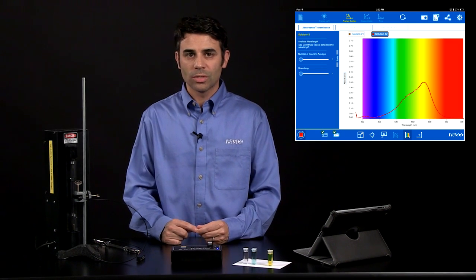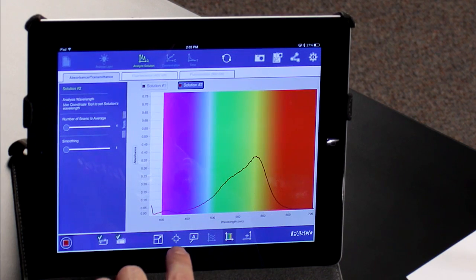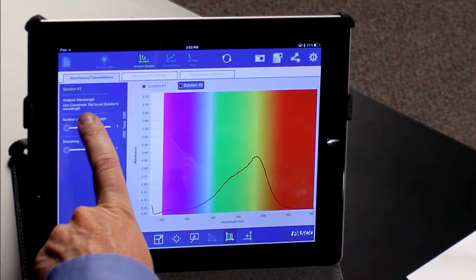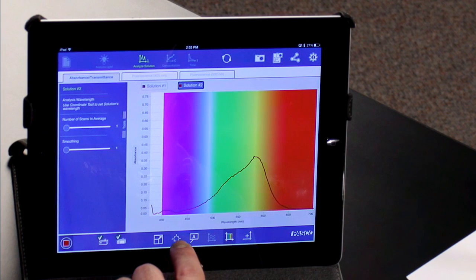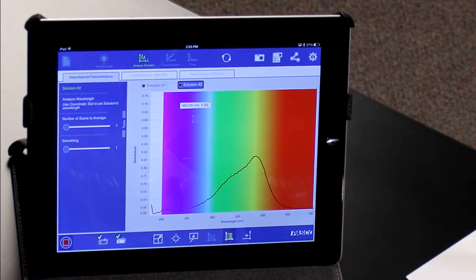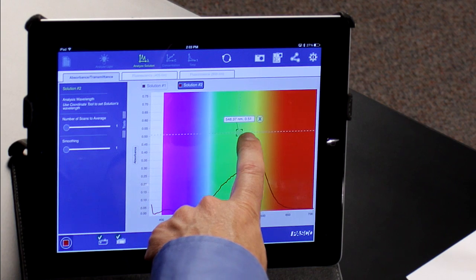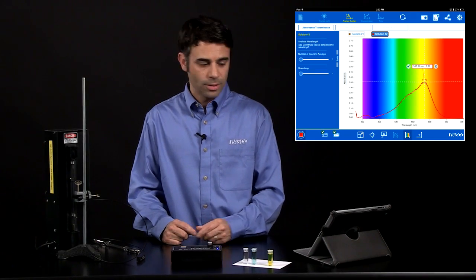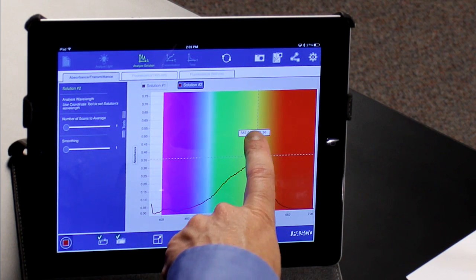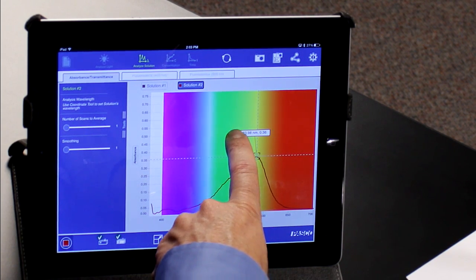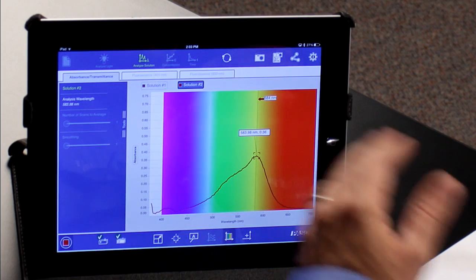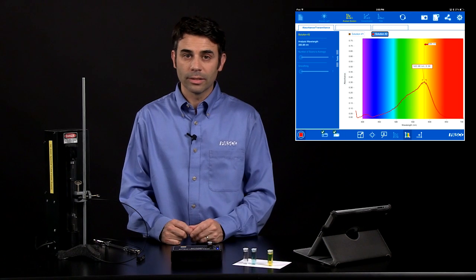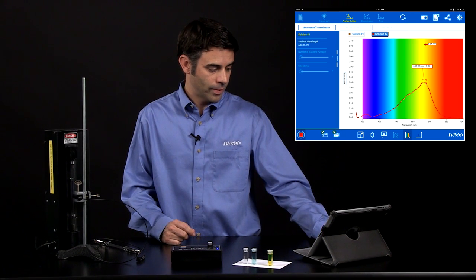To do that, you're going to use the coordinates tool. There's a tip over here in the tools section: use the coordinate tool to set the solutions wavelength. I'm going to touch the coordinate tool. The tool comes up. I'm going to drag it over to the area of the curve that I want to do my analysis on, typically the highest absorbance. And I'm going to hit the check button. Now I have a line indicating that that's where I'm going to do my analysis of the crystal violet in this case. And I'm going to stop.